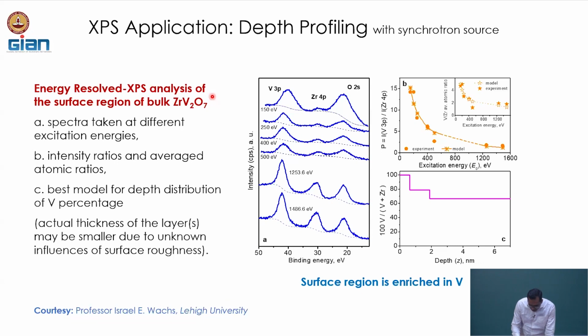So for that, this synchrotron experiment, of course, we have the energies corresponding to the aluminum as well as the magnesium sources, which are like 1.5 and 1.2 kilo electron volt. And what we are seeing is that we see peaks from both vanadium 3p and zirconium 4p, right?